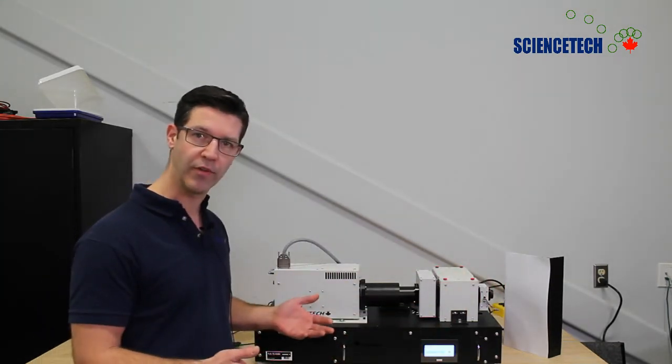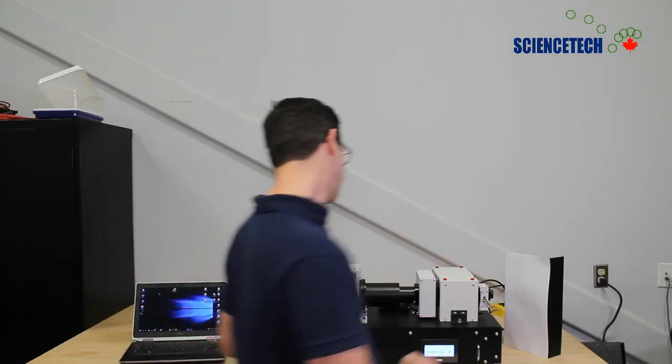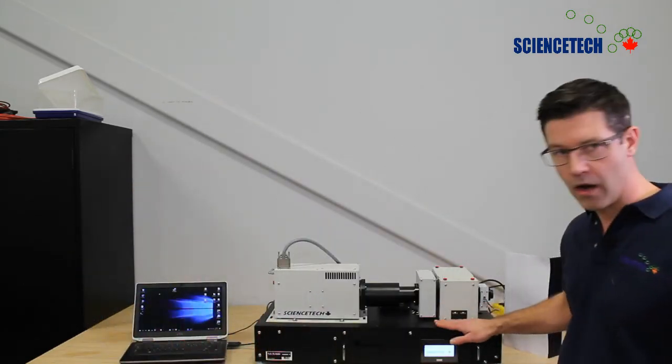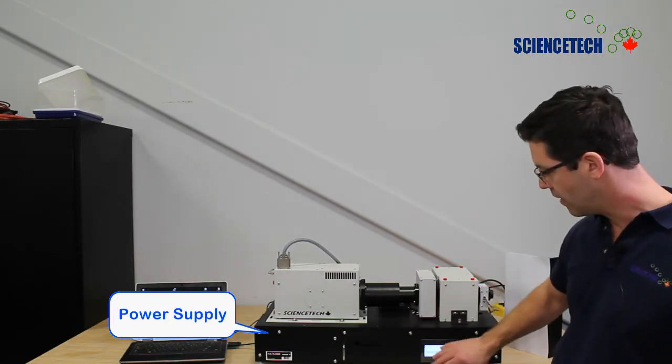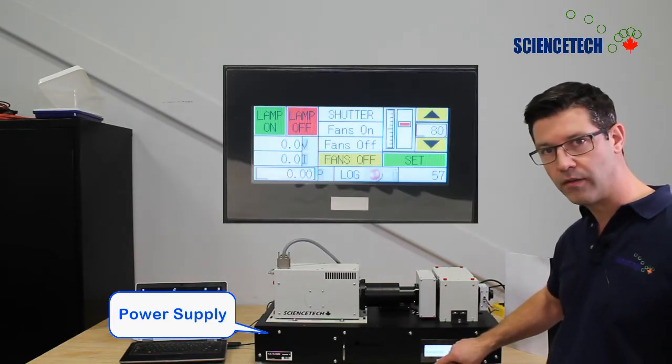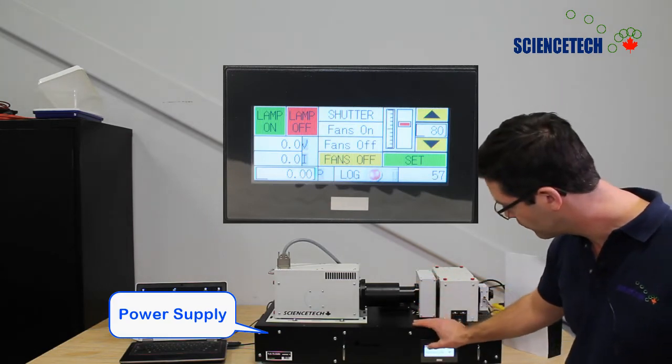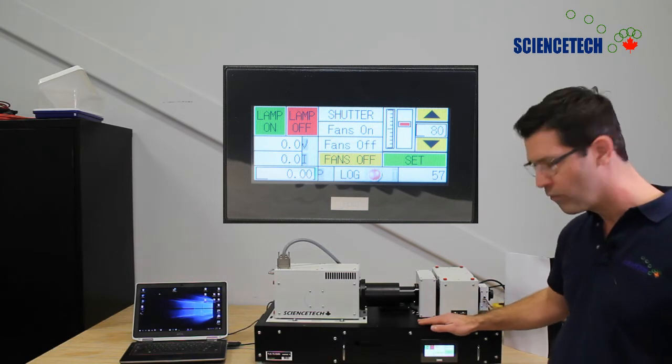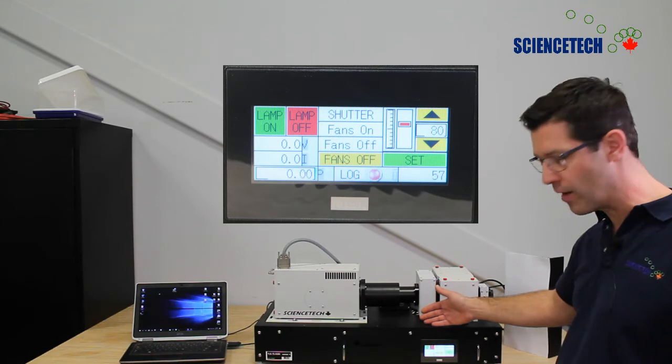I'm going to show you how to turn the system on and show you what it looks like. Our 601 series power supplies are integrated into the base of the system, and here we have a touchscreen that we can use to turn on the light source. I've just pressed OK at the splash screen after the power supply boots up.